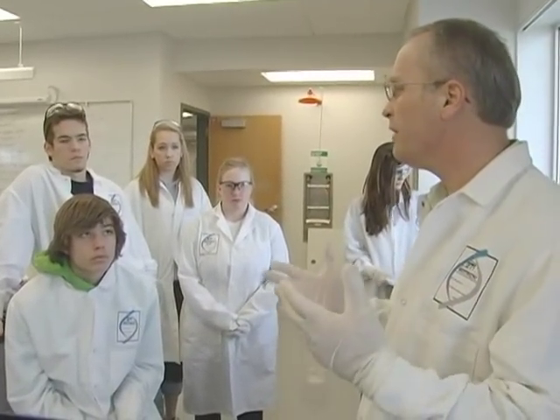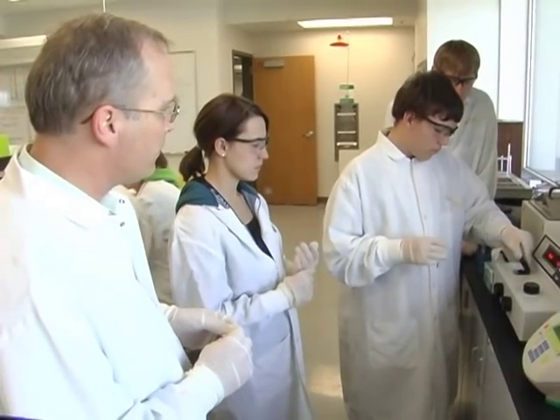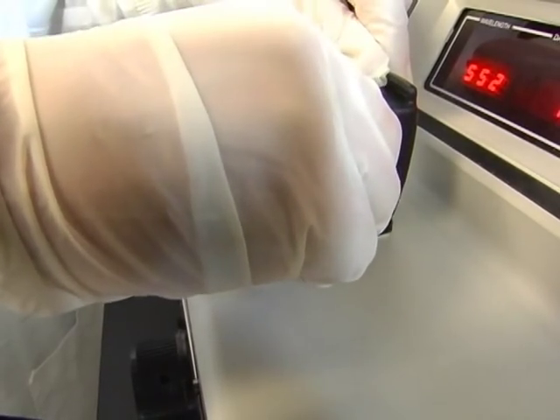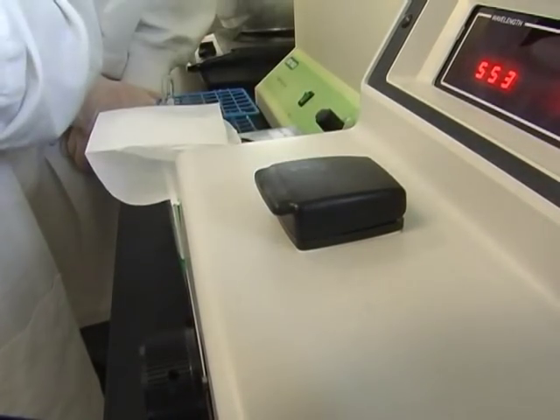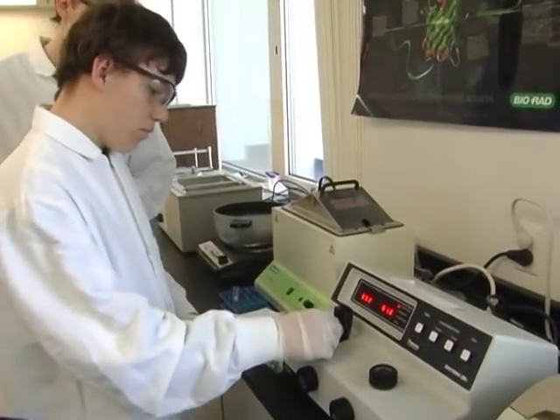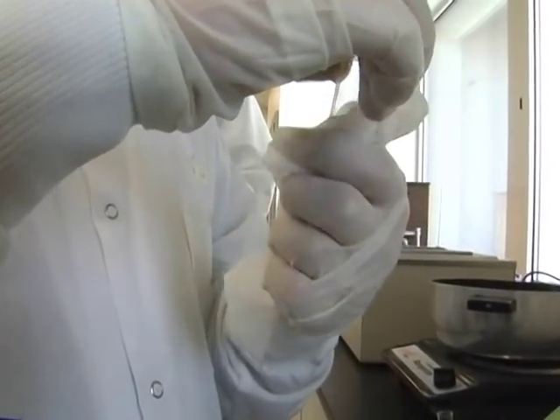Now we're going to learn how to use a different piece of equipment called a spectrophotometer. His goal is to have his students ready to walk out of his classroom and into a scientific laboratory as an intern or even an employee. If you were to walk into a medical lab, a genetics lab, or even a forensics CSI lab, it would look very much like this lab.